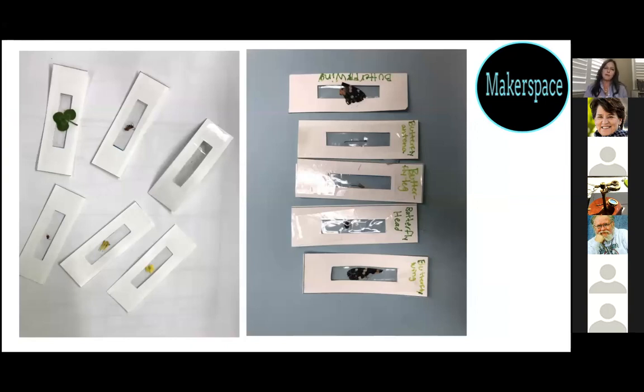One of the things I discovered is that the kids make lots and lots of slides. I had run out of the slides that come on the Foldscope when you start to fold it up. There are lots of different ways that you can make your own paper slides and just use transparent tape. We made a template on cardstock, but really, you don't even have to have a template. You can just put things right in between and not even make a slide. We just made lots and lots of slides, depending on what the kids came across and found.